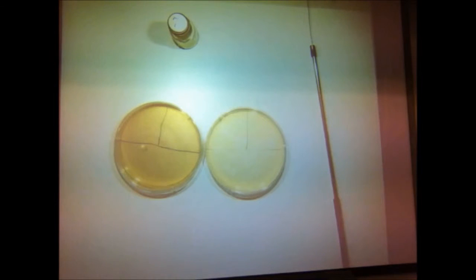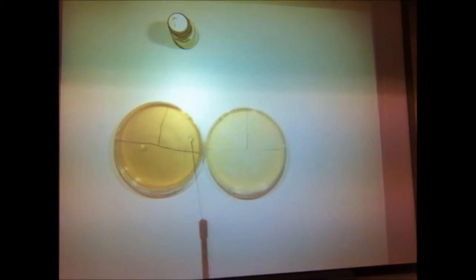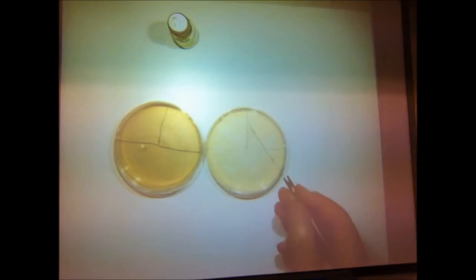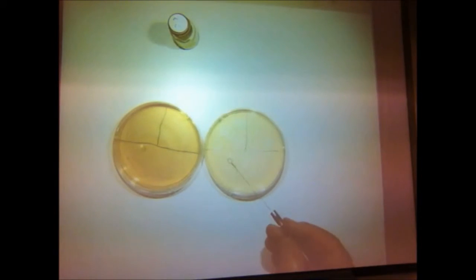and the more times you do a streak plate, the more familiar you'll become. There is another method of using streak plating, or there's several actually, and in some cases microbiologists will use their wire loop, and instead of doing the squiggle method, they'll do a series of streaks, like so. Same thing happens, you're still drawing out the same loopful of agar into a much thinner region.